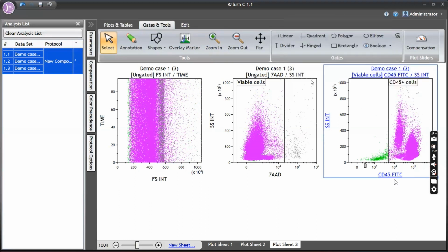Done. Next plot. Sir, why remove dim CD45 cells? Negative or dim cells, why remove? You need to remove that, right? Because that could have some amount of debris, and these populations can show non-specific or false positive CD34.